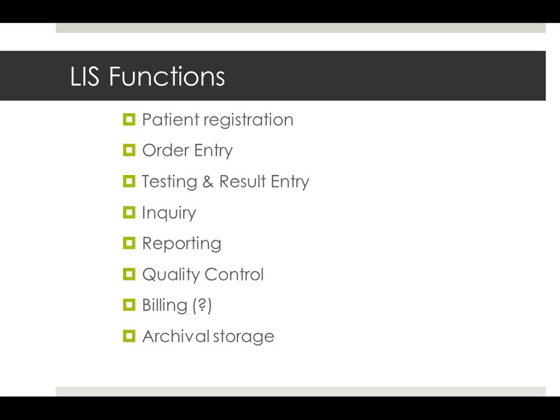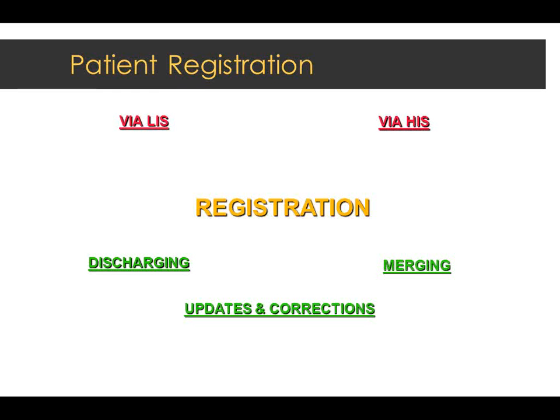So LIS functions in a hospital setting for us: patient registration, order entry, testing and result entry, inquiry, reporting, quality control, billing, and then some kind of storage. So let's go through those.